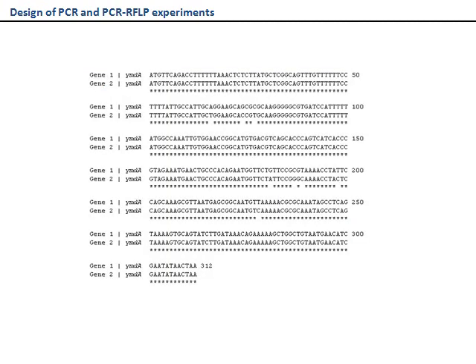In this case, the service will show the typical clustal alignment for DNA. The alignment will show 50 bases of the genes per line. When a specific position of the nucleotide of both sequences is the same, as for example for the first 50 bases, then asterisks under each pair of bases will indicate the match.